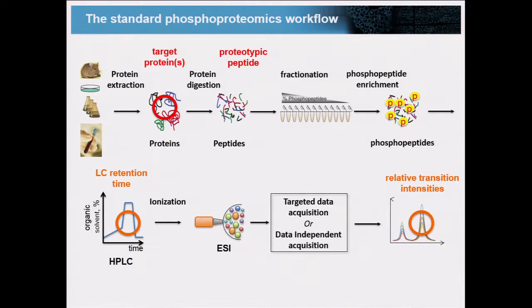What is going to be extremely relevant, and we're going to look a little bit more into detail here, is how we use LC retention time, and to some extent how we use relative transition intensities, because these become extremely relevant when we're looking at PTMs.